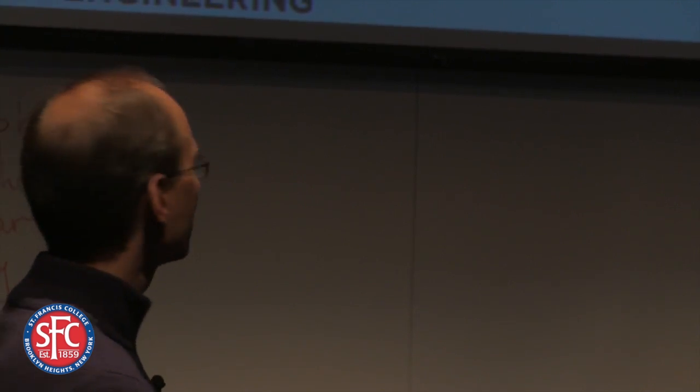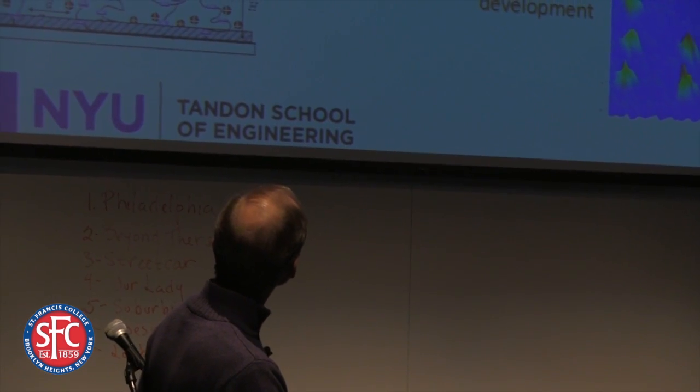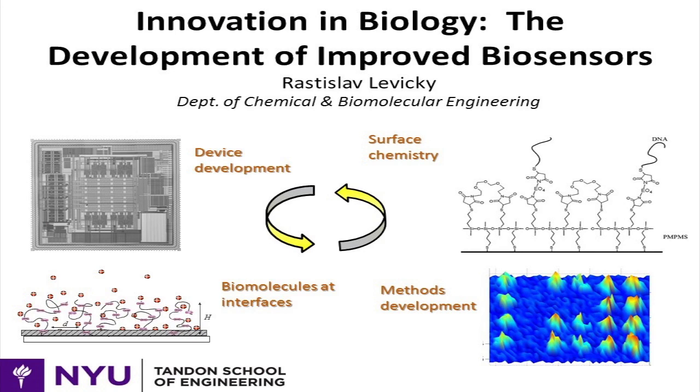And then also we try to develop technology. So that involves developing methods. So how do we look at biomolecules on surfaces? How do we look at their interactions? And then also integrated chips like this. This is essentially biosensors. I'll say more about this as the talk goes on.